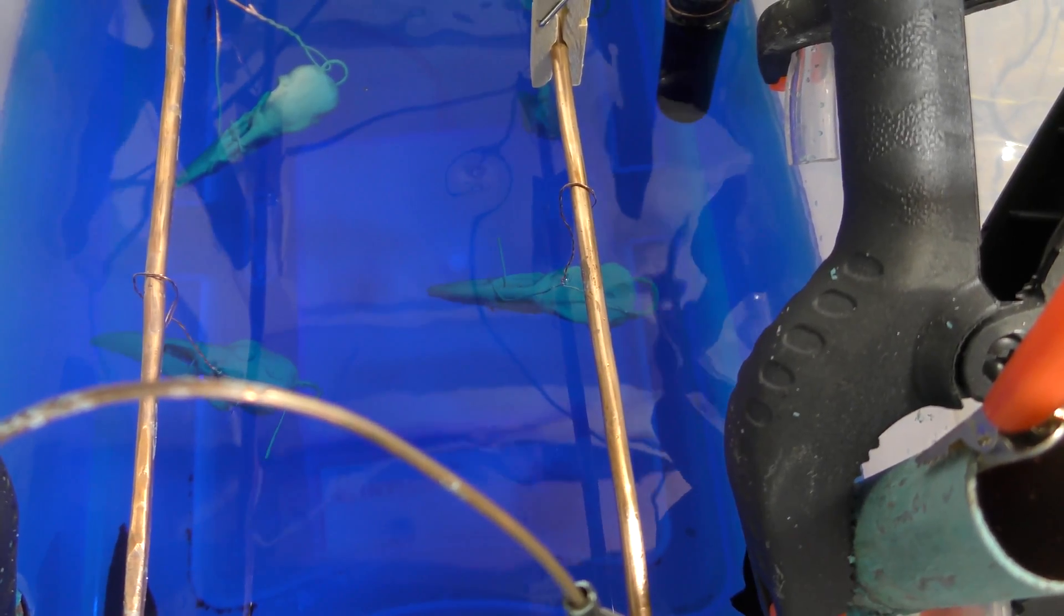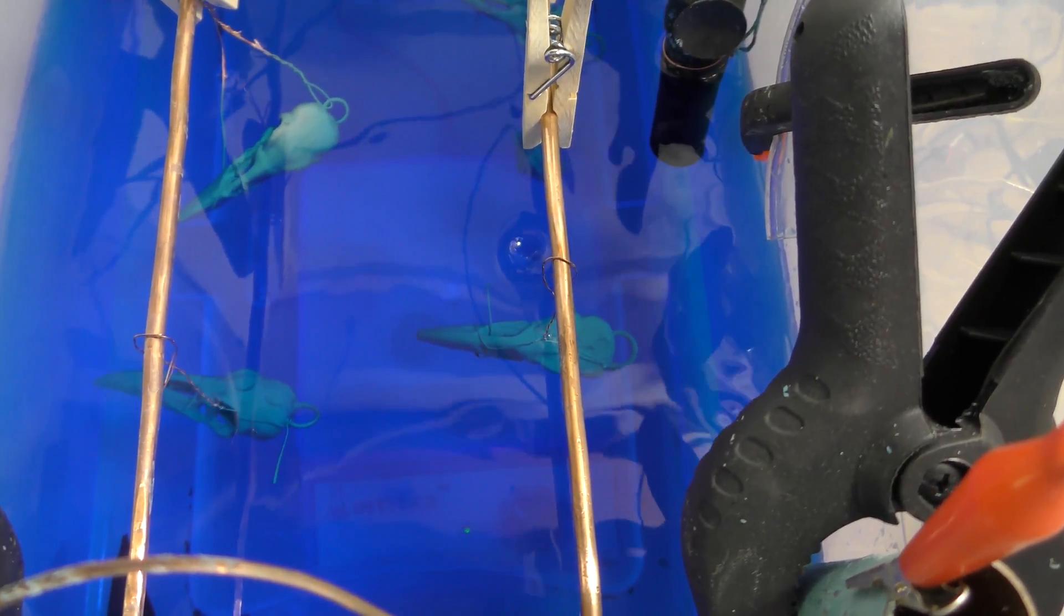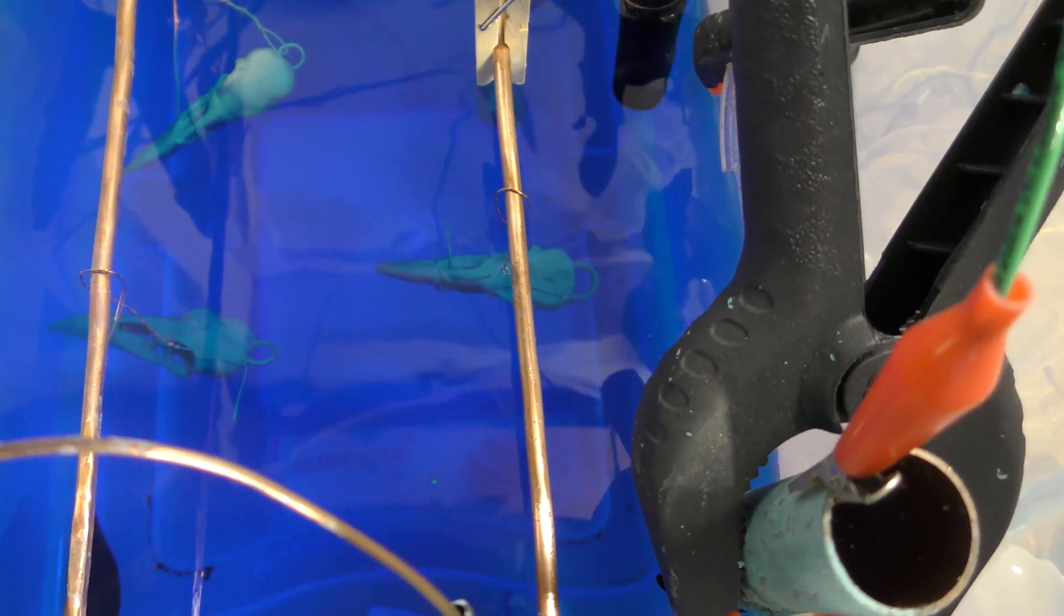They have very direct spacing. And any time that it's a little bit different from that, it won't work. So this one, barely any whirlpool going on. The rings are dancing. There is no texture. It is very even.